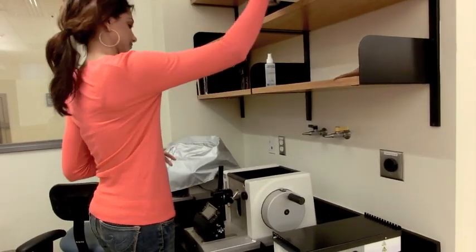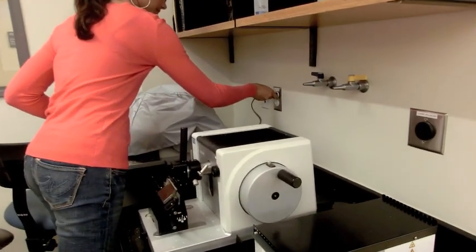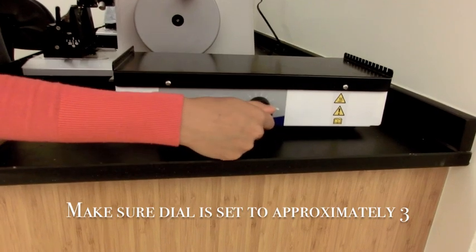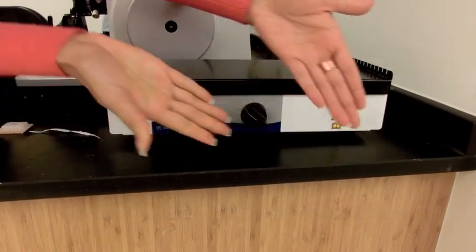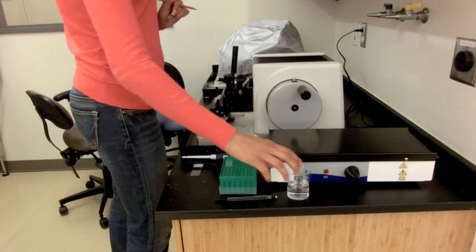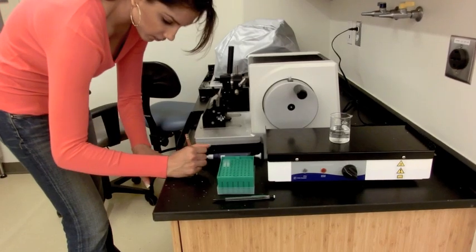Uncover the microtome. Next to this machine you should find the slide warmer. Plug this in and adjust the dial to the middle position. Place a beaker of warm water on the slide warmer and keep a transfer pipette within reach.